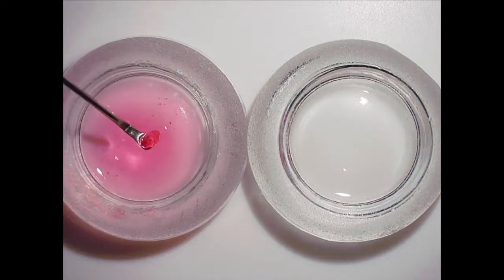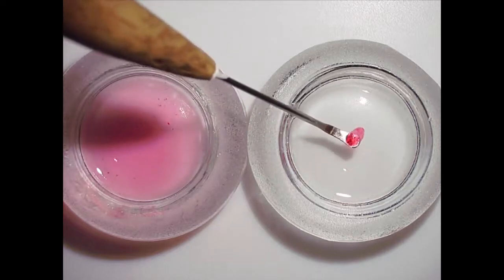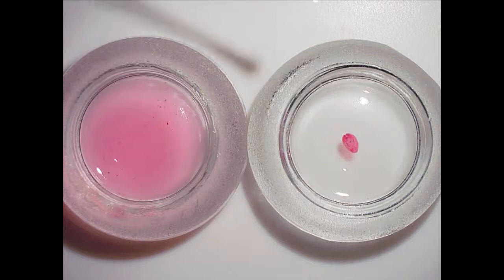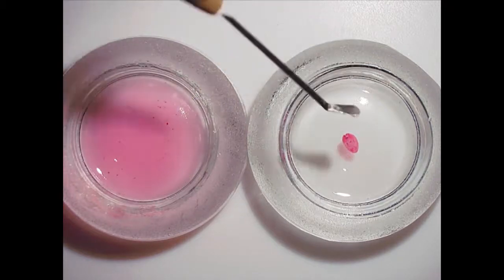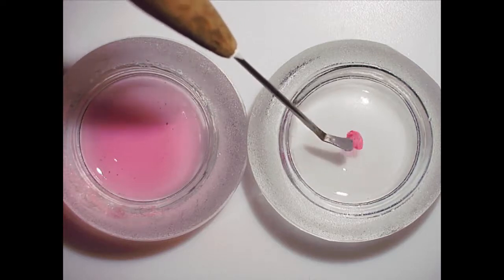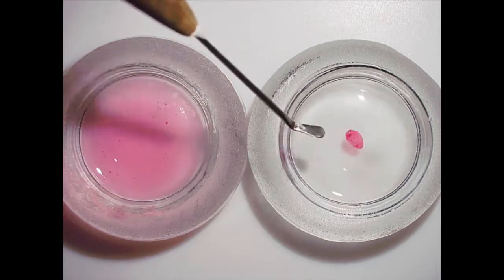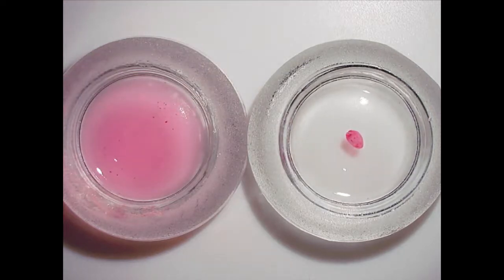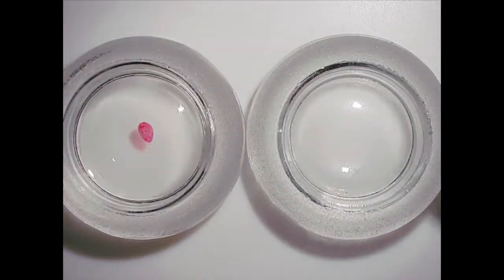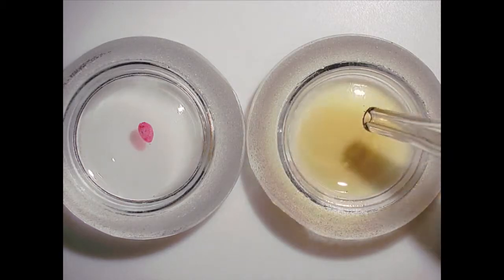It's nearly translucent. I get under it, just remove it from the dish, and now into the 95% alcohol. And again, this gives you an opportunity to use a spatula to remove any excess stain that may be in the specimen. From 95% alcohol, we go to clove oil.